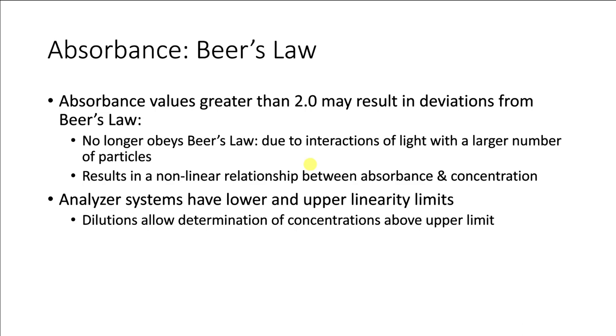The biggest thing that we have to remember, though, is once we dilute something and get a calculated result from it, then we must also apply the dilution factor applied to the sample. So if I diluted something by 2, I get a measurement that looks about that. Then I get a measurement, and then that measurement I have to multiply by 2.